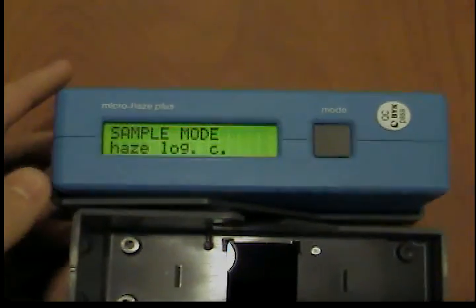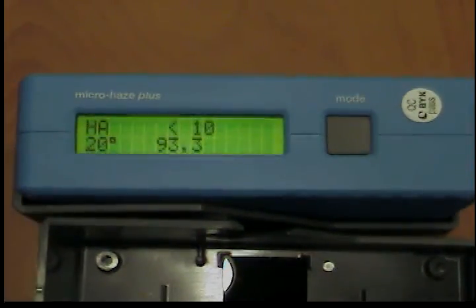Please ensure in this case as well that the displayed values correspond to those printed in the protective holder. After approximately three seconds, the calibration is completed, and the measuring unit can be removed from the holder to perform measurements.